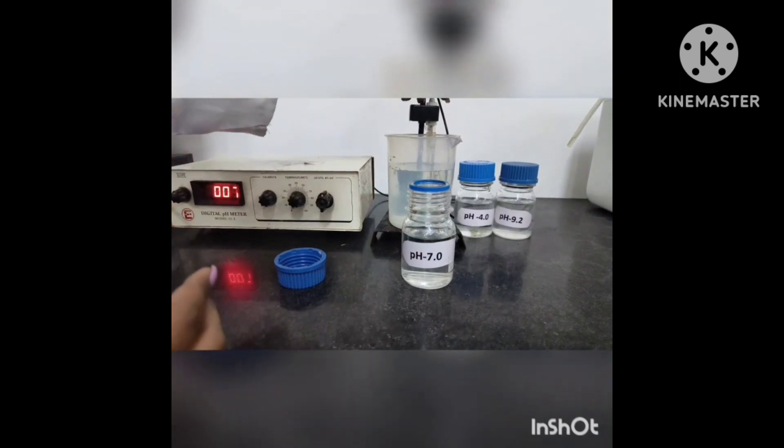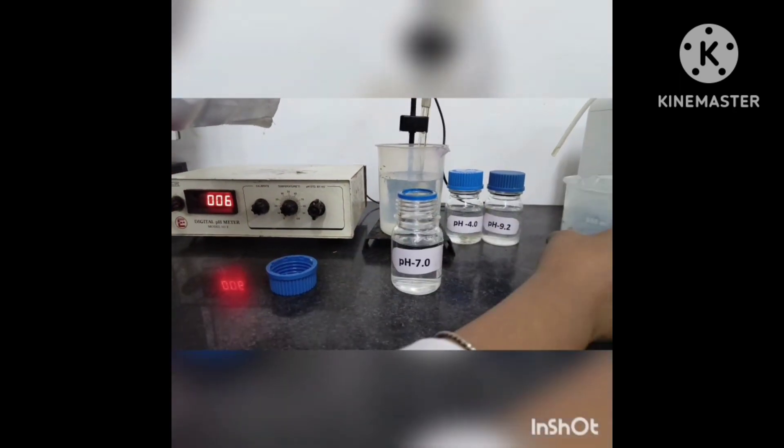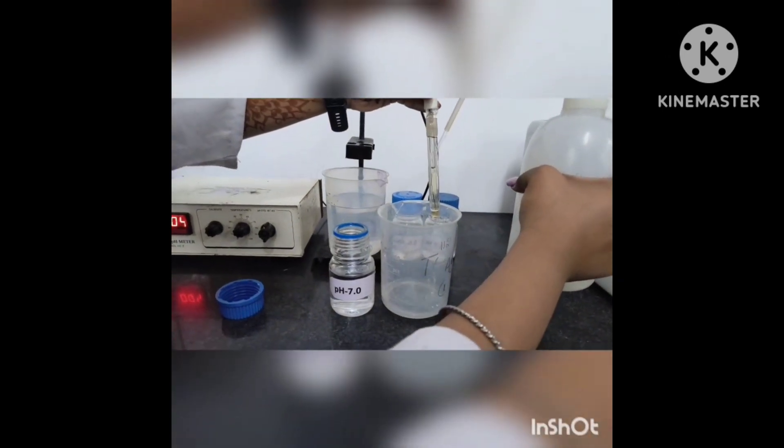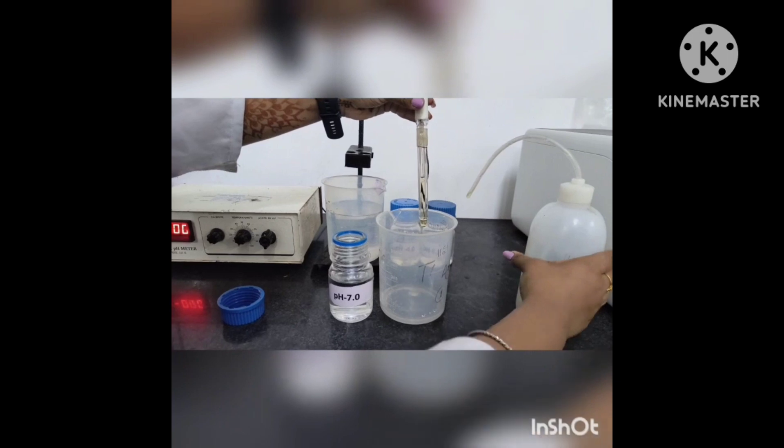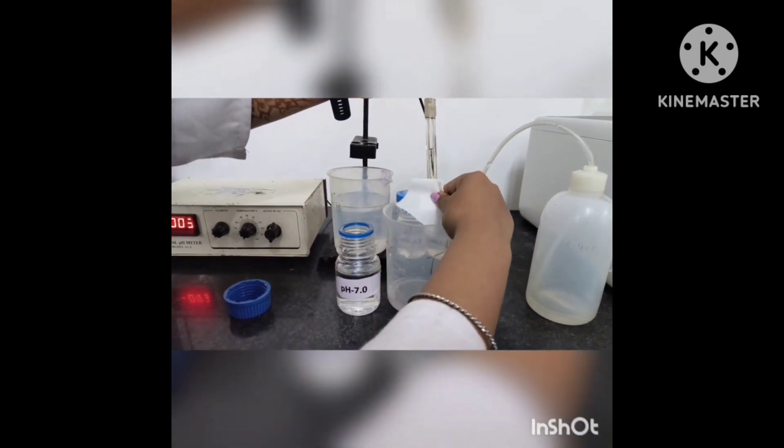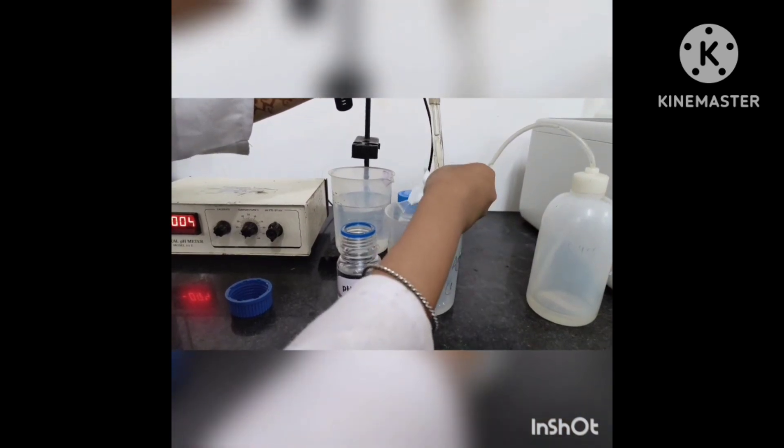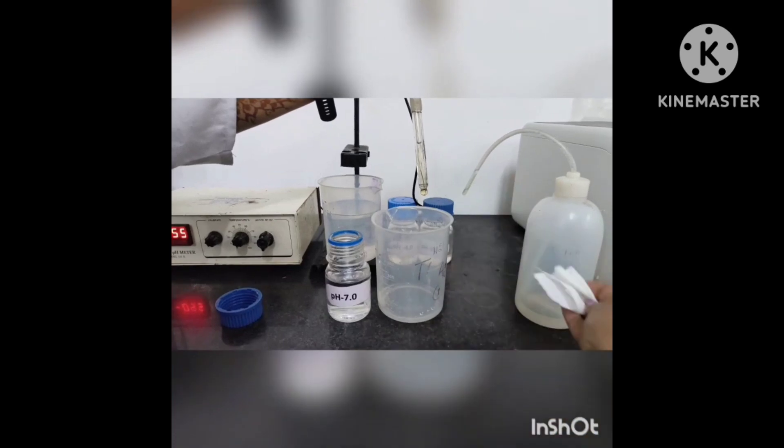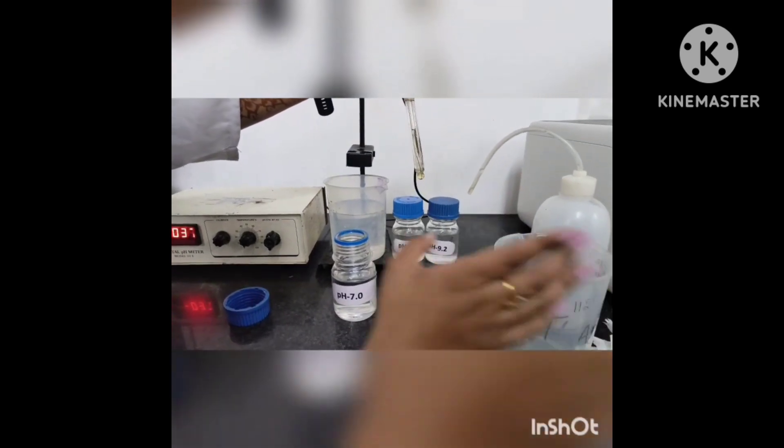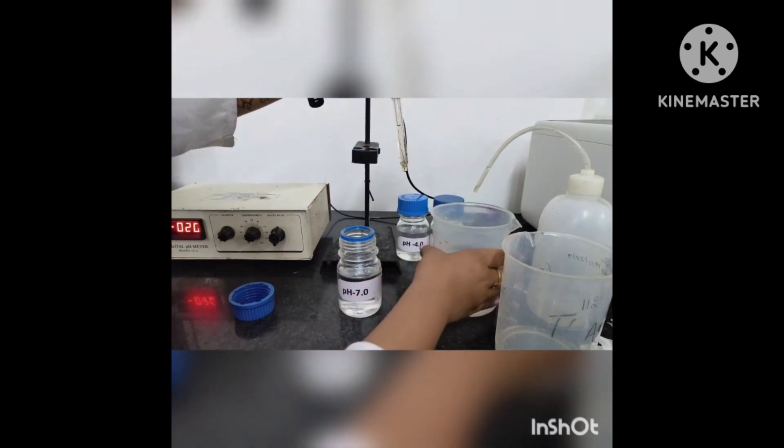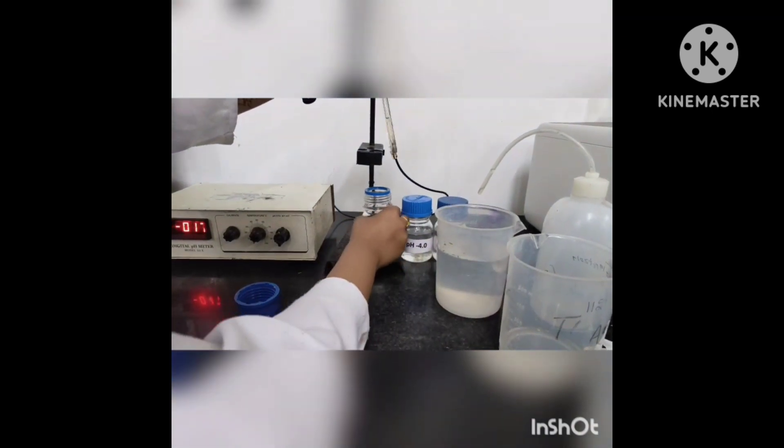The precautions we need to take while using a pH meter are: wash the electrode with DI water and wipe it with tissue after calibration with light hands to avoid rupturing of the membrane at the bottom. When not in use, electrodes should be dipped into DI water which should be changed after every 4-5 days.